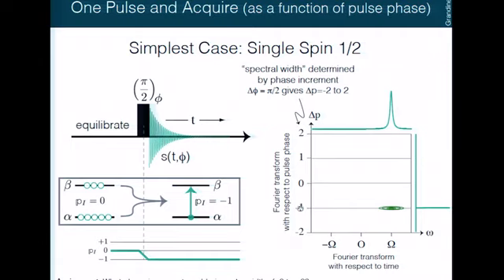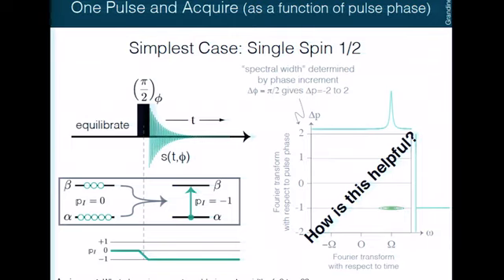But what we know now is that this experiment had a delta P of -1. So in this dimension, this experiment will have a resonance here at delta P of -1. And everything else will be zeros. These guys won't show up, and only there will we have our signal. That's it. Now, you're probably thinking, all right, that's kind of a stupid 2D experiment to do. So why would this be helpful to me?